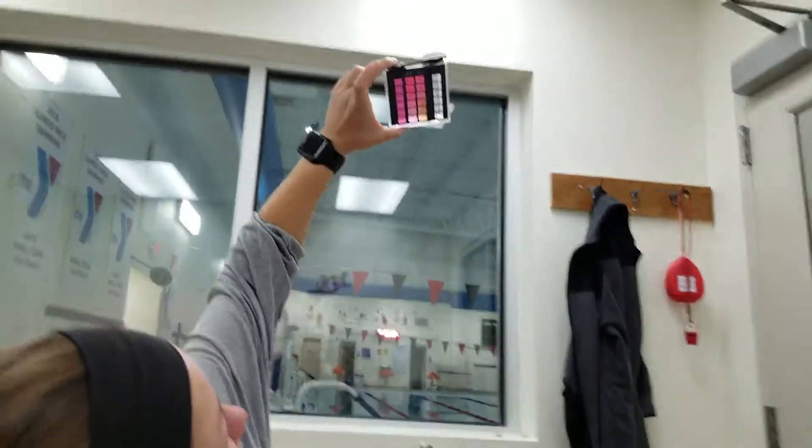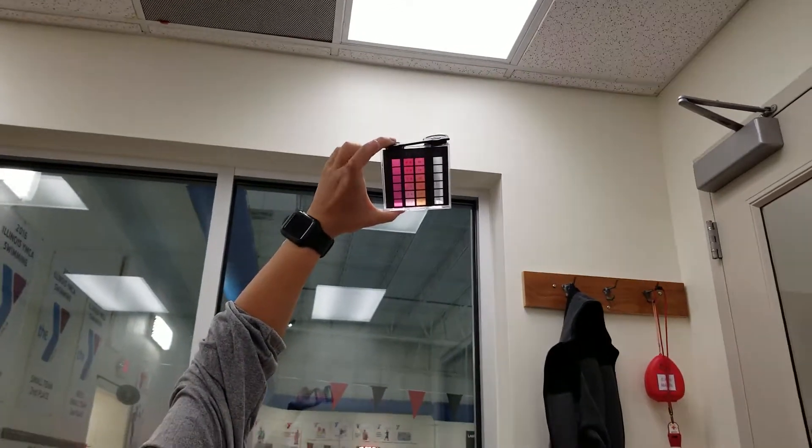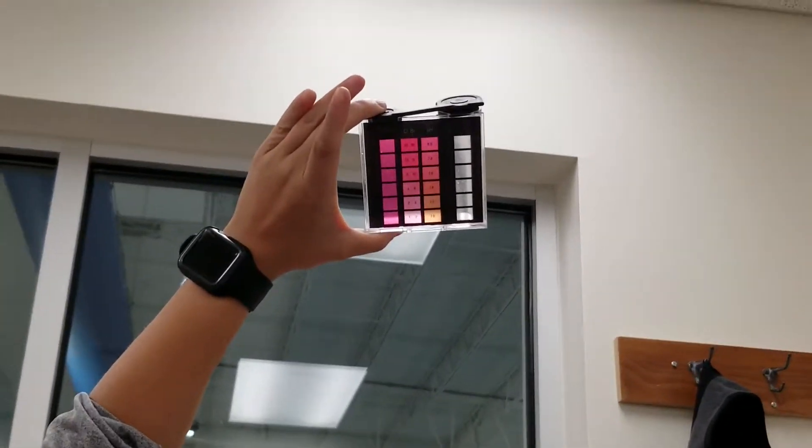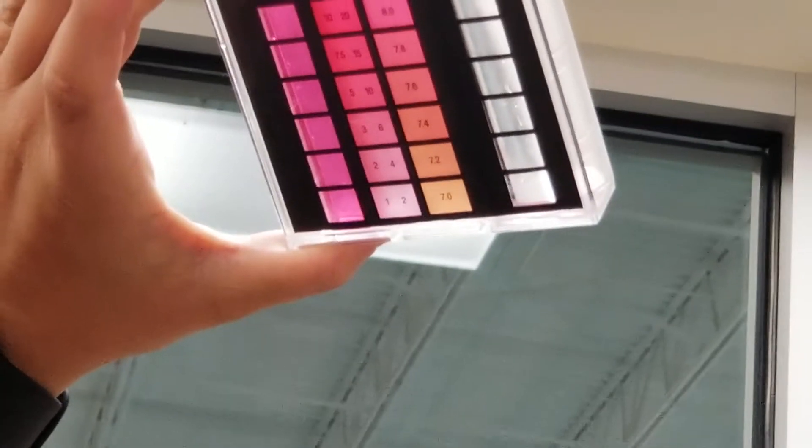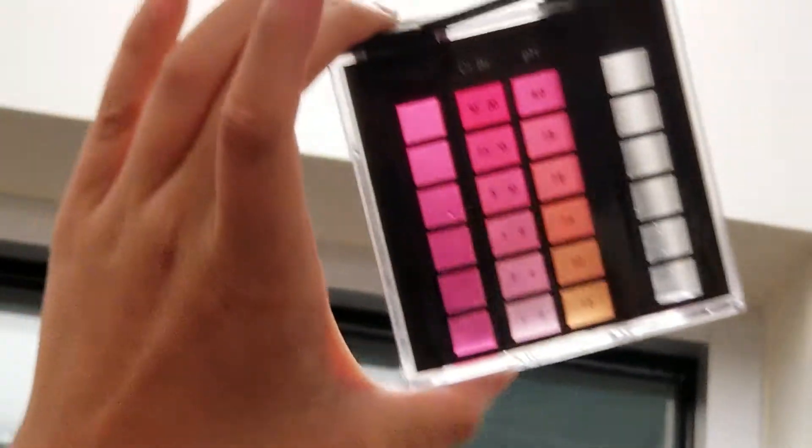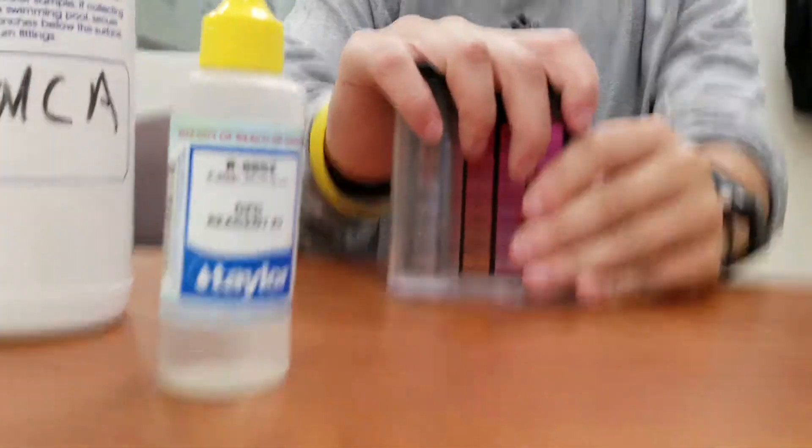Now that we have the test in there, we'll take a reading of that sample. What's that look like? A five, probably. Okay, it looks like a five on the FCL. We'll bring it back down and write that number down. That is our free chlorine.